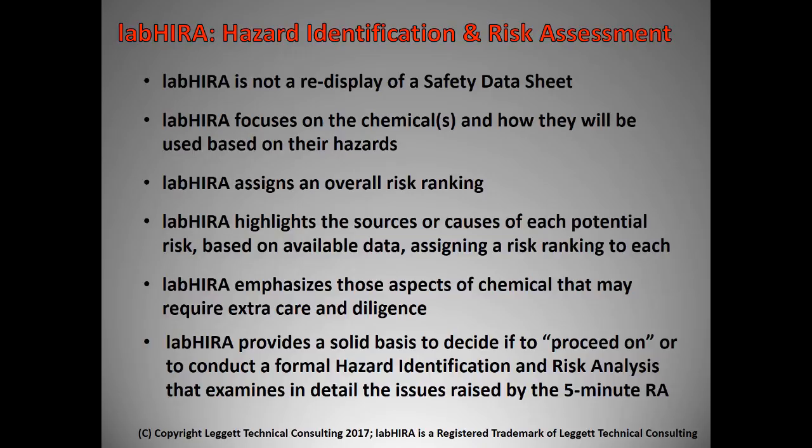It also highlights the problems with each particular chemical, because each of the various elements that you saw in the summary has its own risk ranking. So you can see immediately that labHIRA will emphasize those aspects of the chemicals that may require extra care and diligence. And again, labHIRA provides a solid basis to decide whether to proceed or conduct a formal hazard analysis. And you can see that all this took a very short period of time.